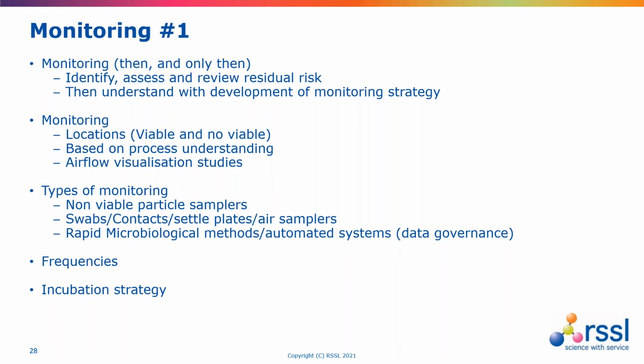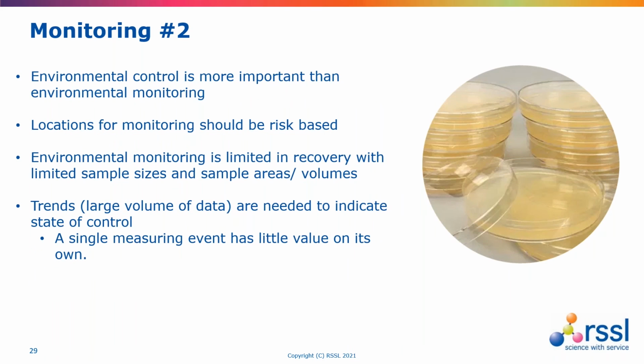And we also need to recognize that environmental monitoring is limited, and that's why a greater emphasis needs to be placed onto environmental control. And the reason environmental monitoring is limited is because of the limited recoveries.